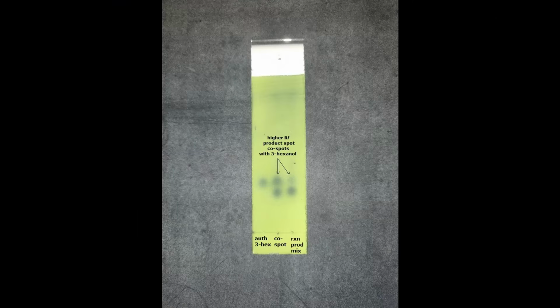The visualized TLC plate shows 2 distinct spots in the reaction product lane, a more intense spot at lower Rf and a less intense spot at slightly higher Rf, suggesting the presence of one major component and one minor component in the hexene hydration reaction product mixture. You can also see that the less intense higher Rf spot co-elutes with authentic 3-hexanol in the center co-spot lane, suggesting the identity of the higher Rf reaction product spot to be 3-hexanol, and this should be confirmed by a more definitive analytical technique such as NMR spectroscopy.